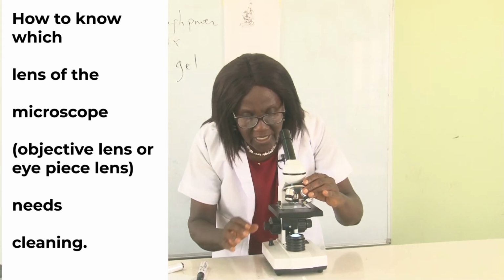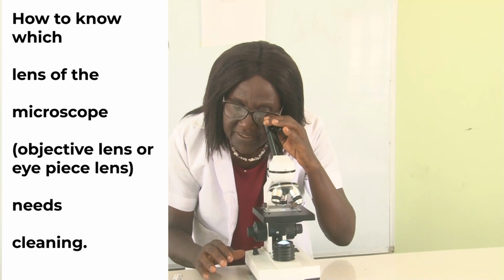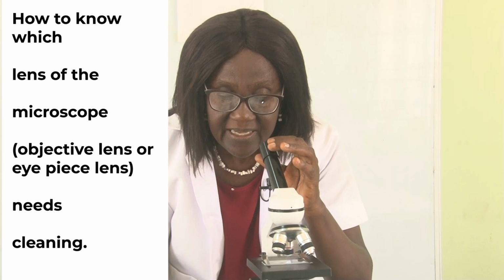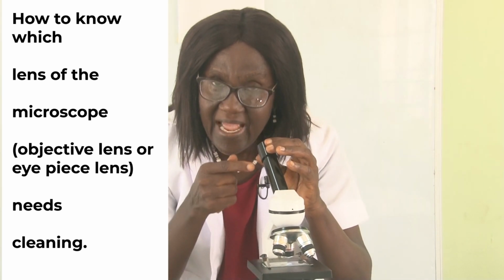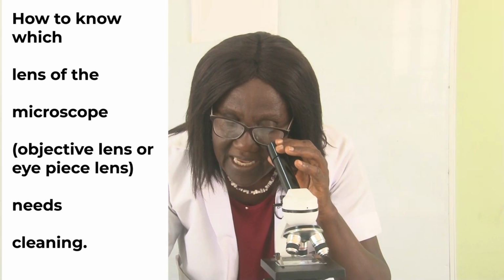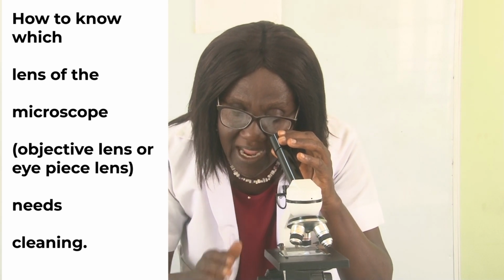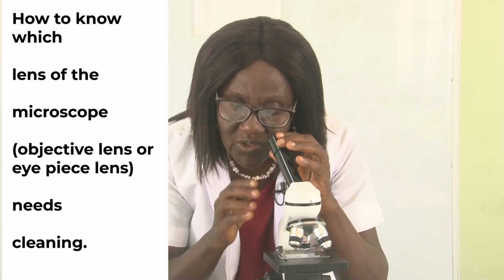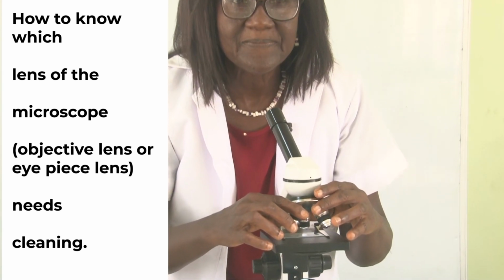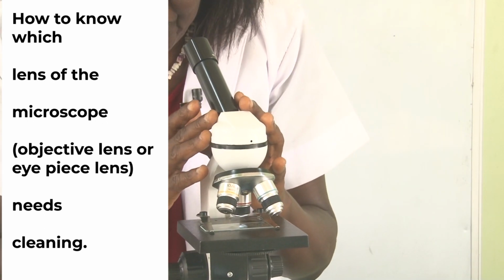Now, when you look at the specimen, rotate the eyepiece. If the dirt is on the eyepiece, the dirt will move as you rotate the eyepiece. If the dirt does not move as you rotate the eyepiece, then the dirt is not on the eyepiece lens, the dirt is on the objective lens. So this is how you know where the dirt comes from.